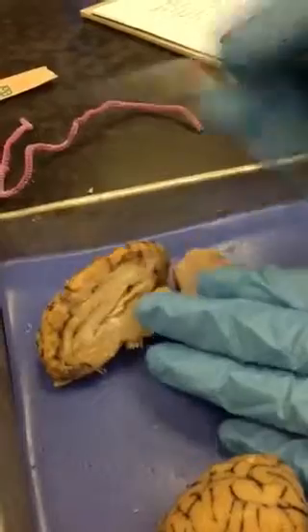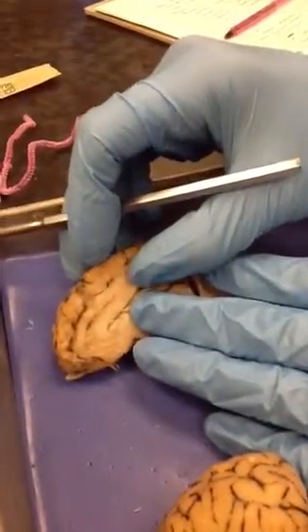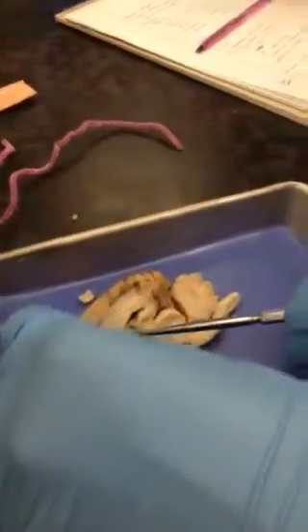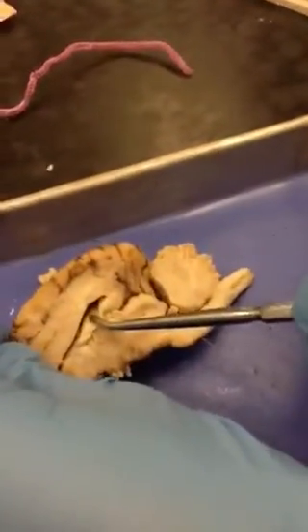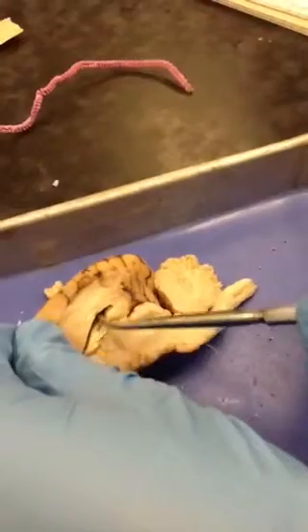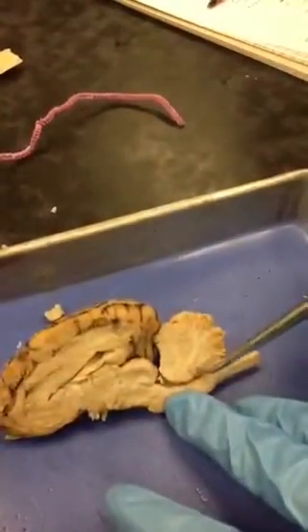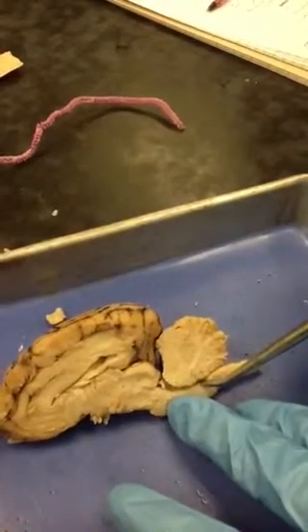In the lateral ventricle, we have the anterior choroid plexus, which is one of the sites for synthesis of cerebrospinal fluid. And then down here in the fourth ventricle sits the posterior choroid plexus.